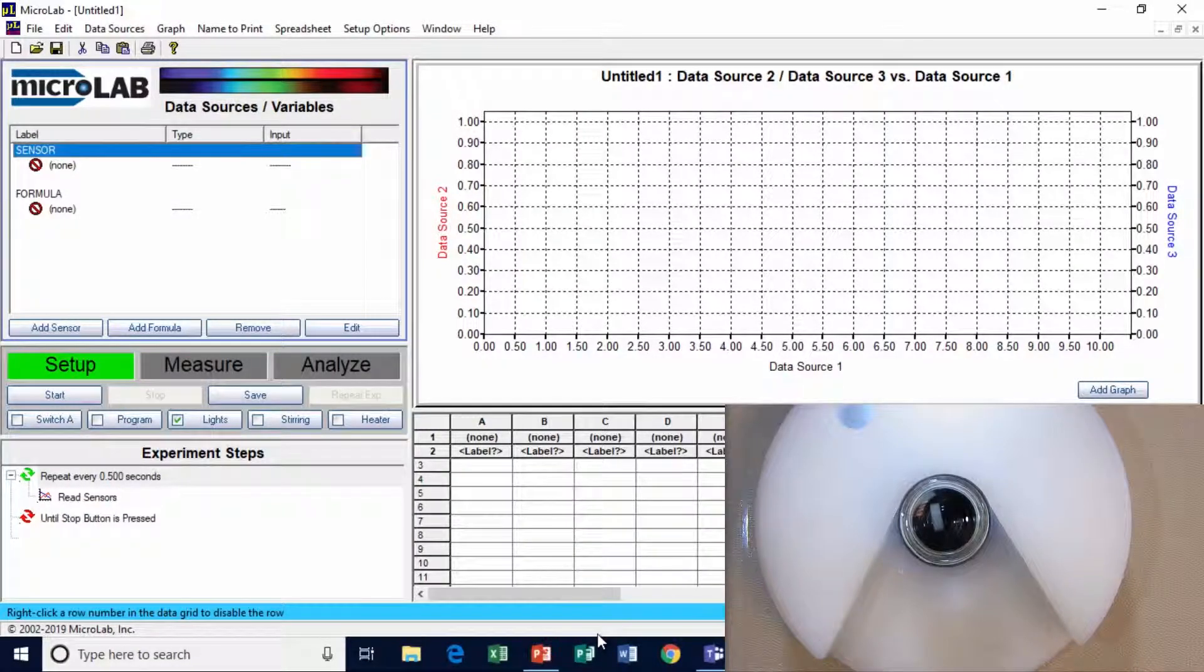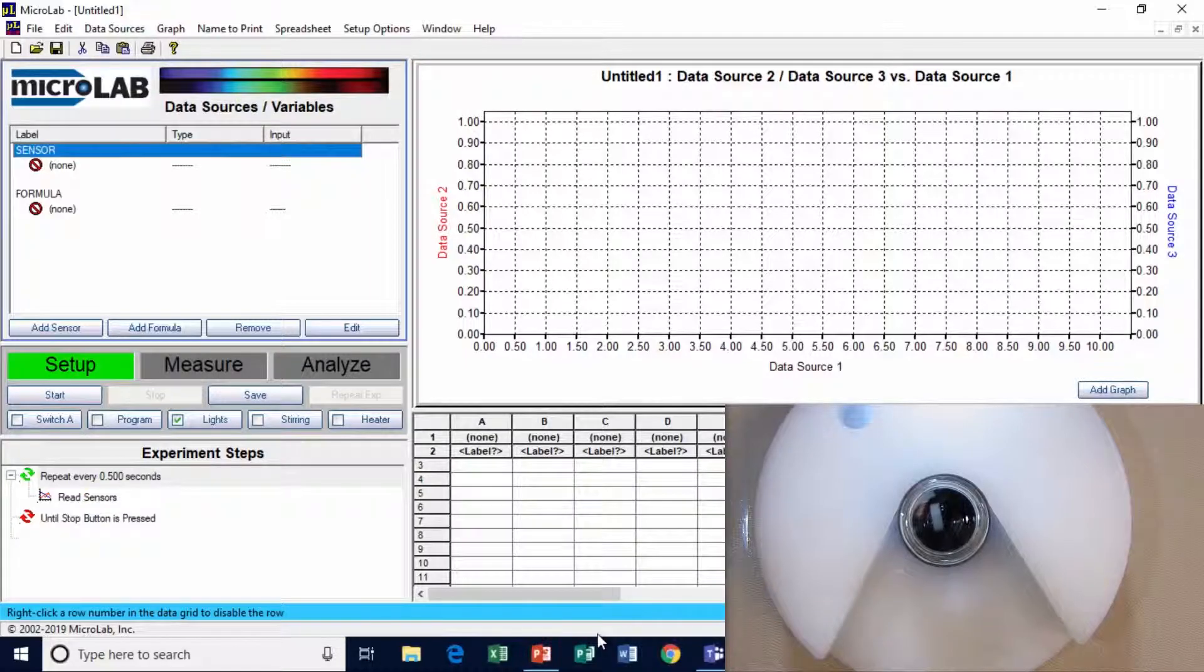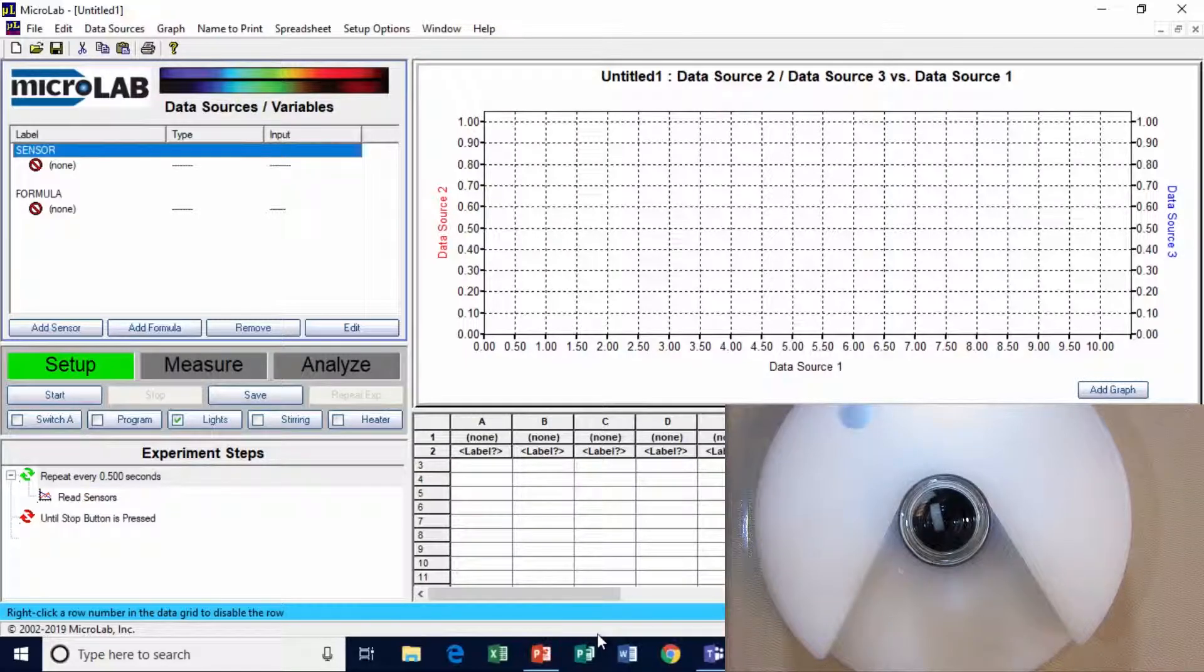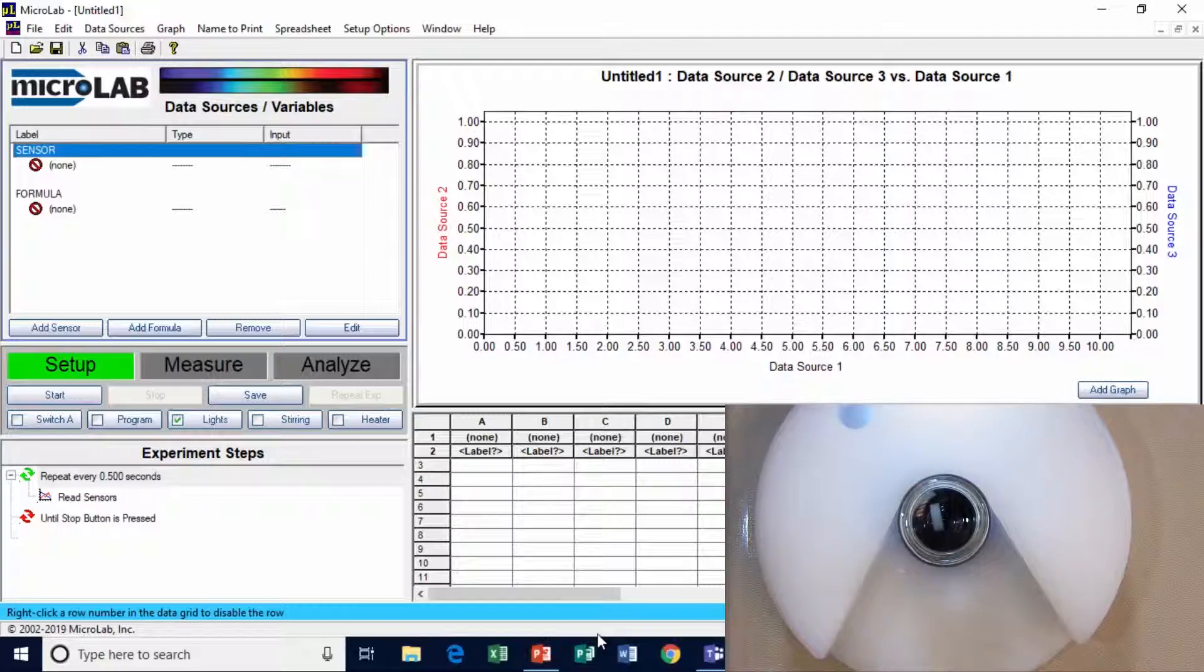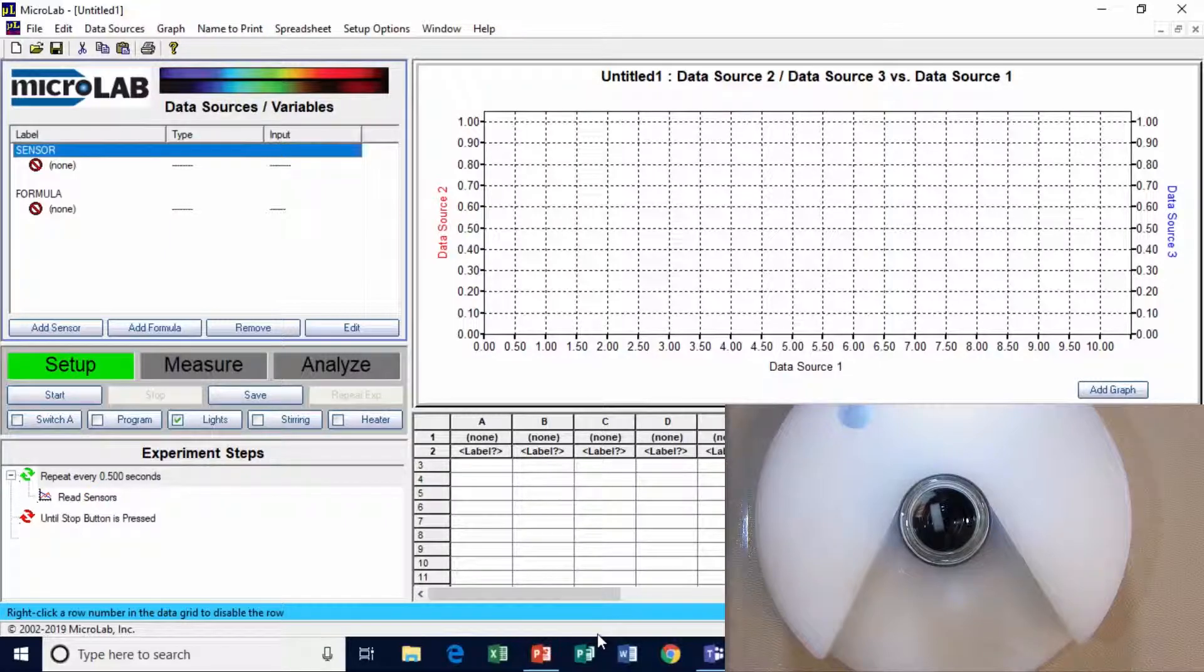We've placed a vial with water in it, and you're looking straight down now, and you can see the stir bar on the bottom. There's a magnetic stir motor right underneath the vial, and it's composed of six coils, and it creates a rotating magnetic field. So there's no moving part in the motor. The result of that is you can reverse it anytime you want. We'll show you the value of that in just a second.